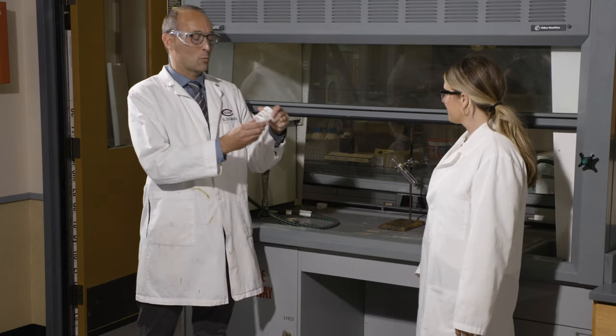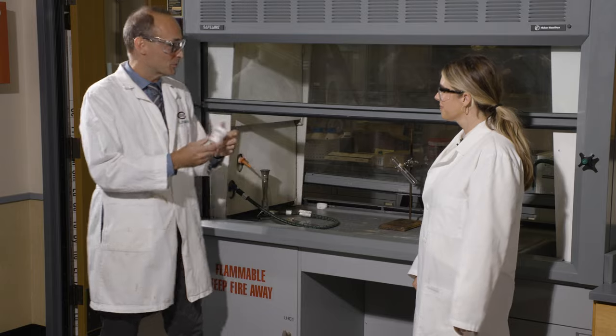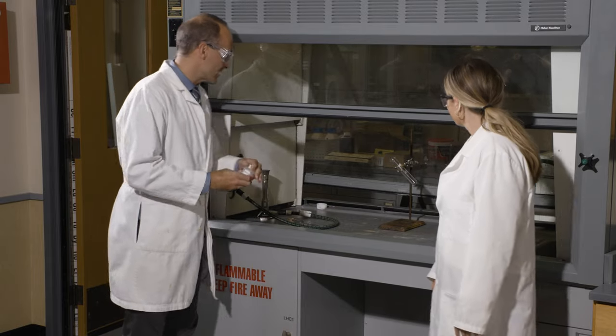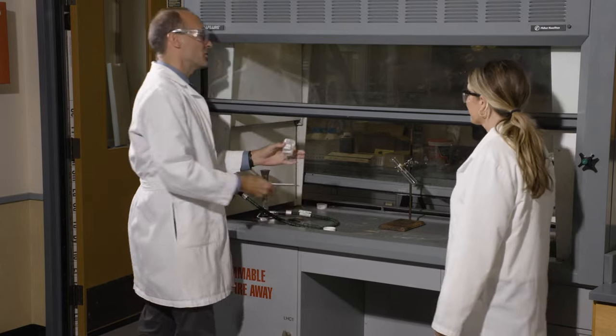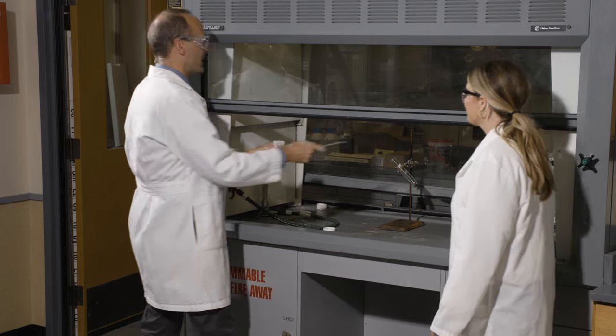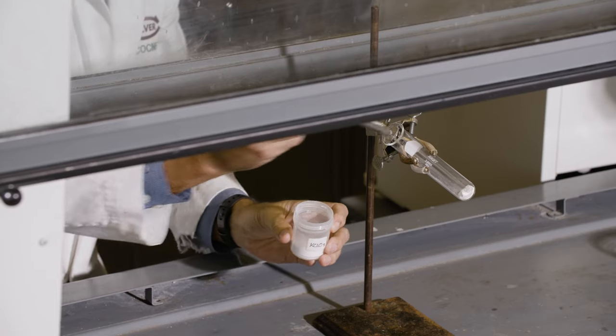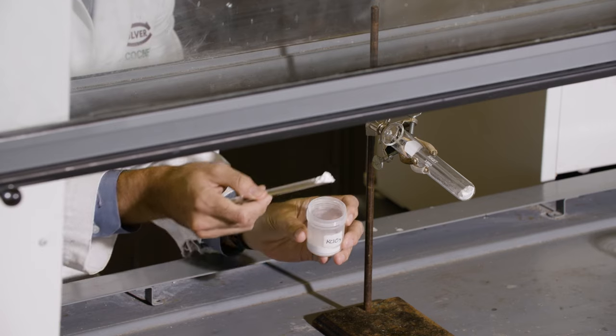And it involves this white chemical. It's called potassium chlorate. We're going to put a little bit of it in this test tube and then I'm going to melt it. And I've already talked to you about what your role is. Your role is to handle everyone's favorite candy corn. Don't eat very much.